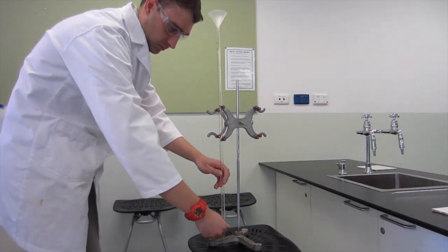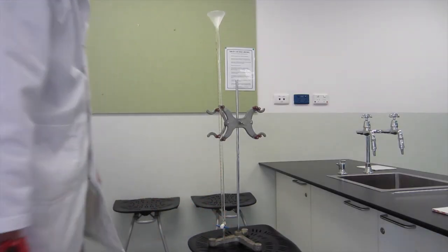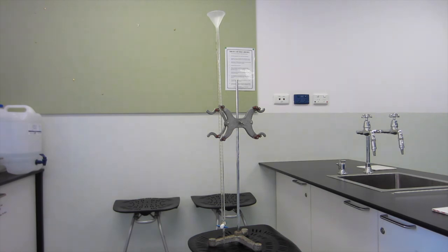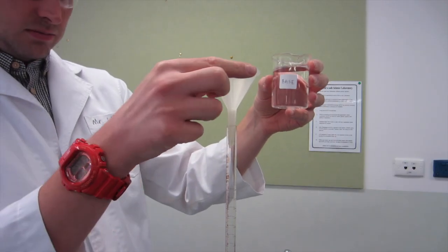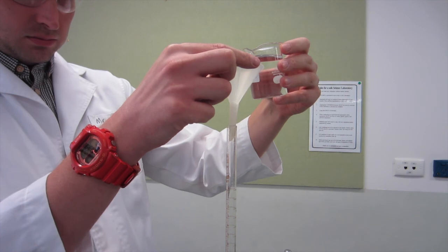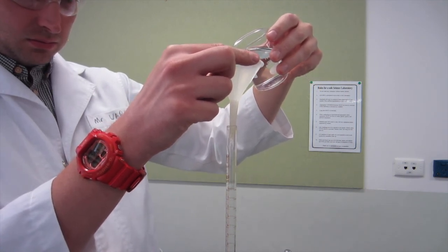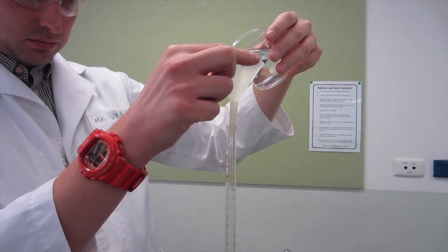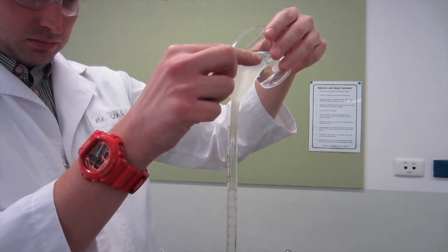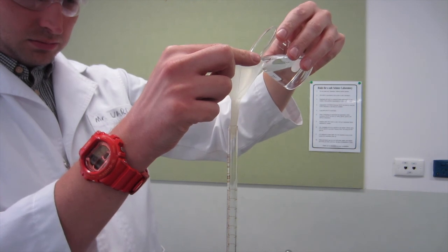First we need to fill our burette. Make sure the stopcock down the bottom is closed and you've placed a funnel in the top of the burette. We're assuming the burette is already being rinsed with the solution we're using, in this case it's base. Gently lift the funnel to allow air to flow in and out. Slowly tip in your solution into the burette using the funnel to guide it in. You fill up until you get to around about 5 mils in the burette.